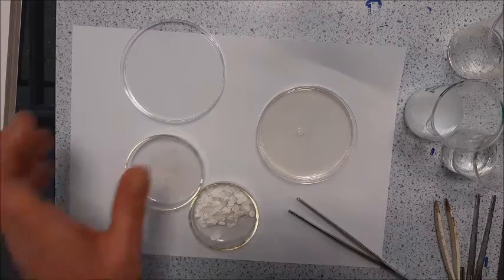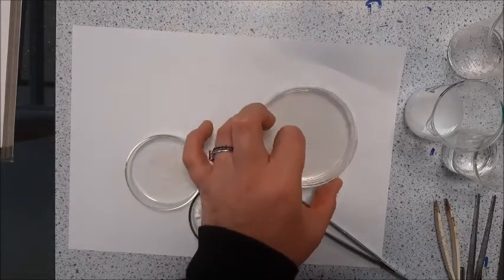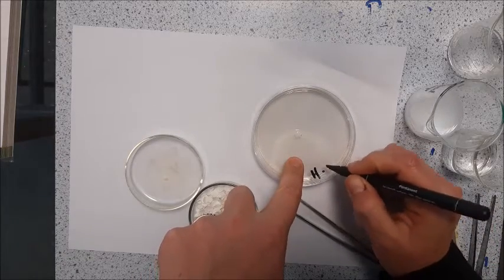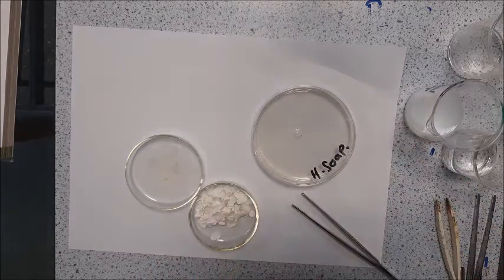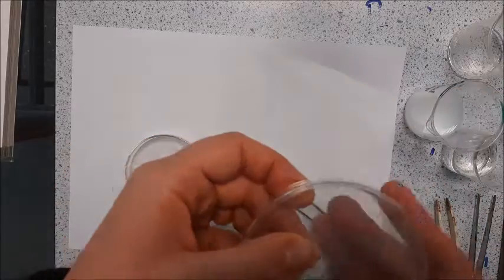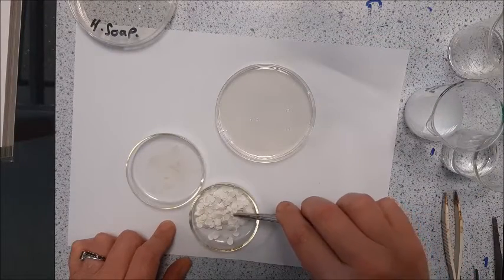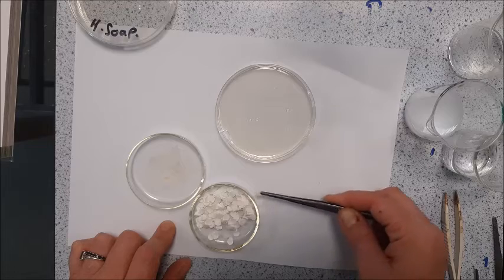Now obviously I need to cover that up as quickly as possible. I need to label that up as well — and soap. And again, I'm going to seal that. I'm going to move on and do my next one, but I've got a fresh pair of tweezers because I don't want to contaminate them.